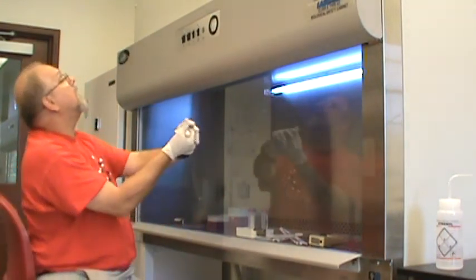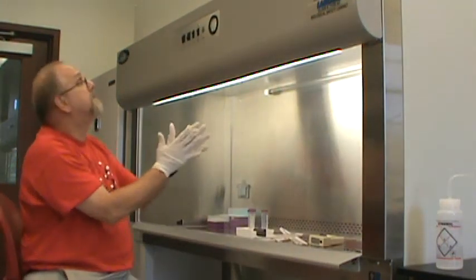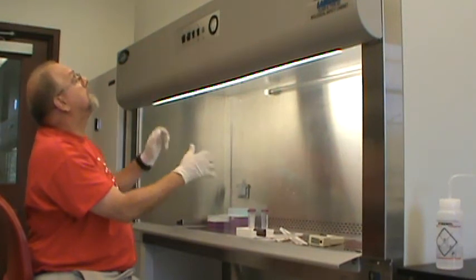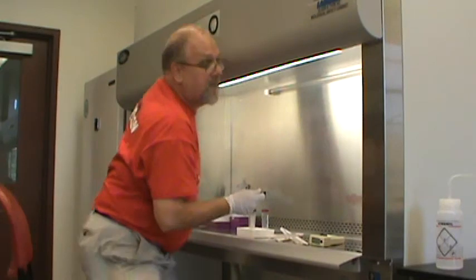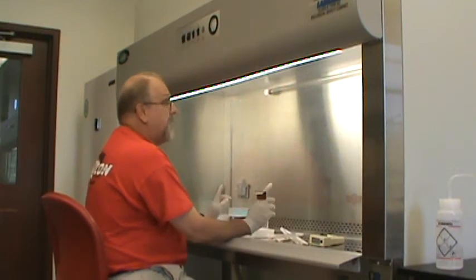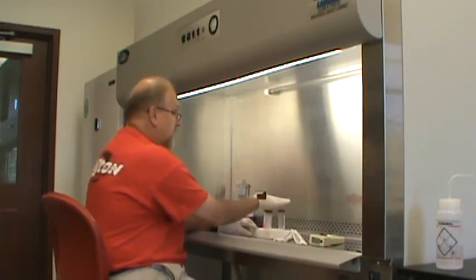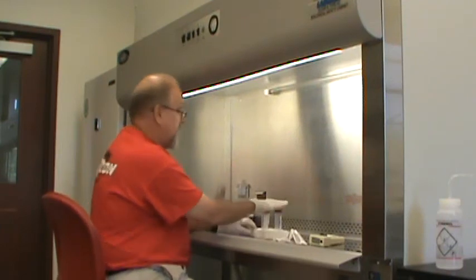When you are ready to go to work in the hood, you switch the UV light off and switch the main light on. Then you lift up the sash — don't lift it any farther than you absolutely need to — and then you are ready to work in the hood. You have to be careful because the sterile air is coming from the top down, so if these are our samples right here, we want to try to prevent reaching over the top of our samples as much as possible.